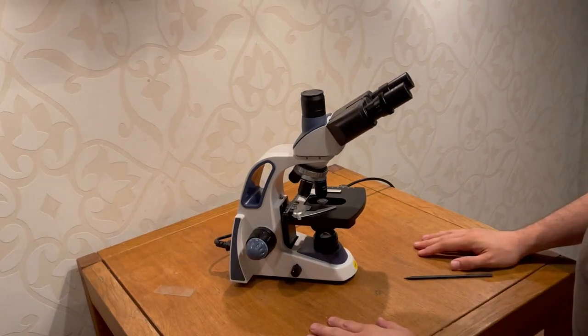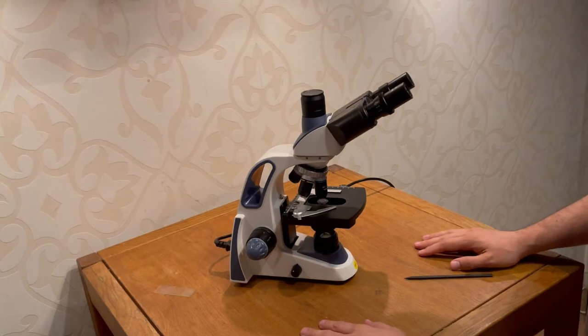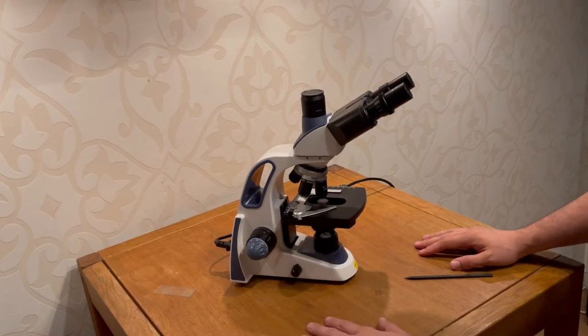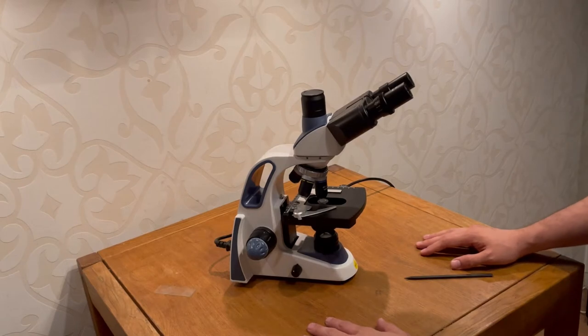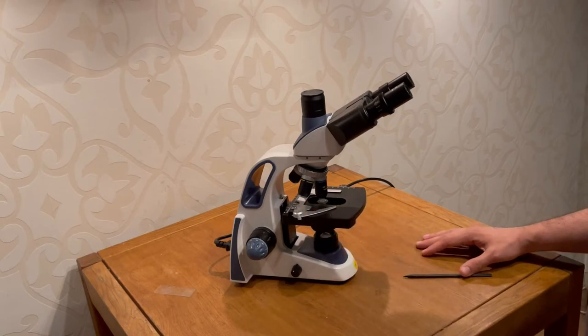Hi guys, so today we're going to take a look at this microscope. It's the Swift SW380T, a microscope that I think is quite well advertised on the market as a cheap, affordable and quite decent quality microscope. Today I would like to share my thoughts about it and actually review a bit of the product that I've received.